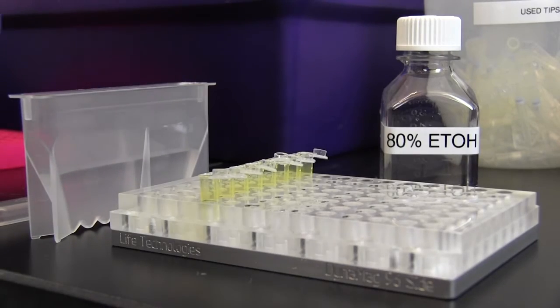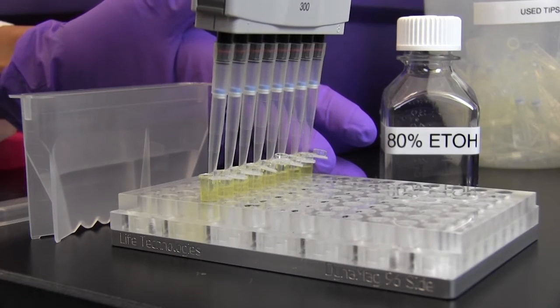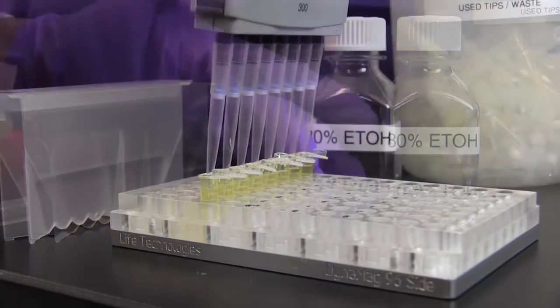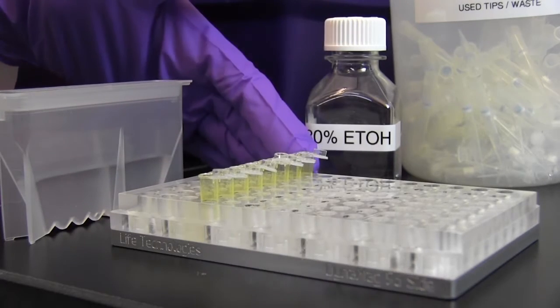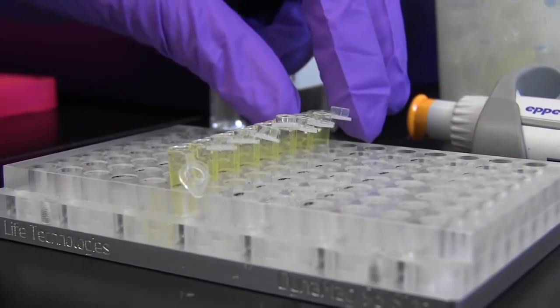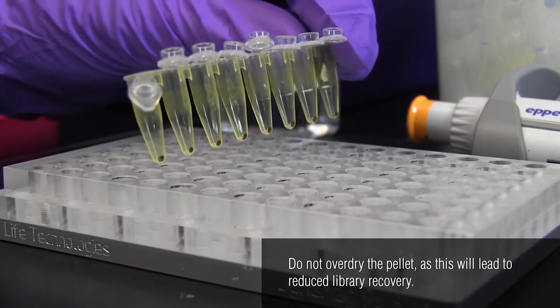Wash the beads with 200 microliters of 80% ethanol while they are in the magnetic field. Incubate for 30 seconds at room temperature and then remove the ethanol. Repeat this wash step once. Allow the beads to air dry while in the magnetic field, but avoid over-drying the pellet.